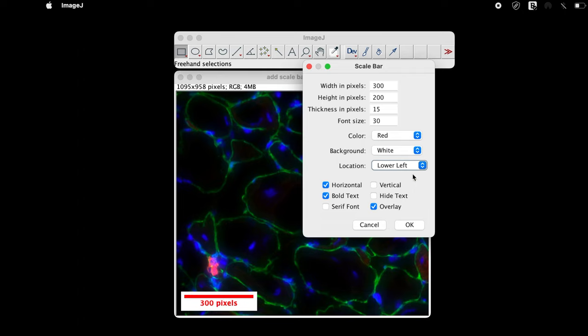The next parameter is to set the location of the scale bar. There are more parameters that can be used to modify the scale bar. For example, checking on the horizontal displaces the scale bar horizontally if required.